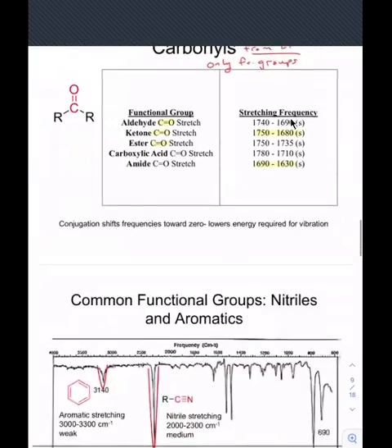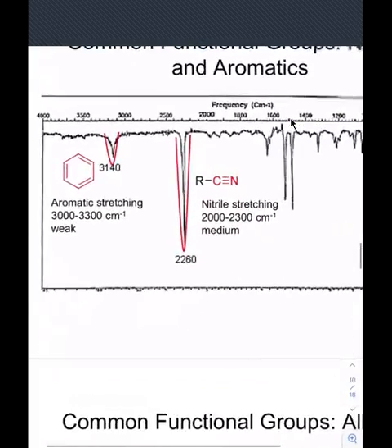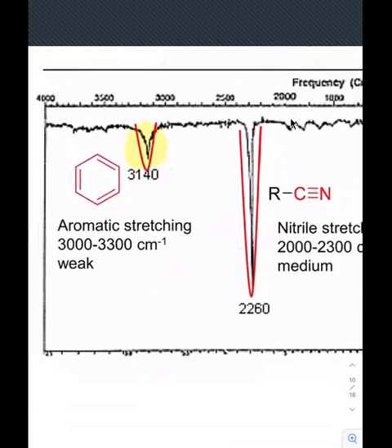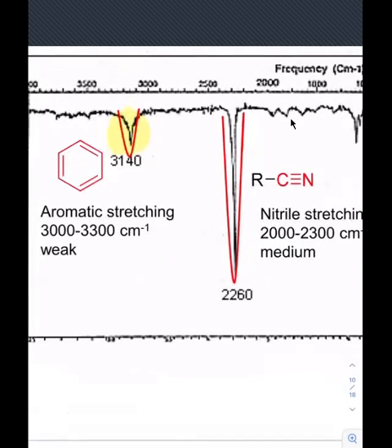All right. Let's look at another set of functional groups, or aromatics. Look at where they show up here. How would you classify that stretch, especially comparing it to that nitrile stretch next to it? When I say classify, would you say it's weak, strong, variable, broad? What would you think? How would you classify that, if you had to describe it?